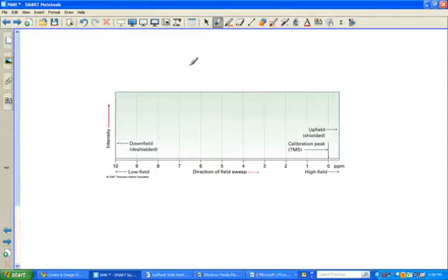This is basically a generic spectrum that you get in proton NMR. There are no peaks or signals shown on here, but I just have the axes shown and a couple of key words so you can see exactly what's going on. Notice the x-axis goes from 0 to 10, sometimes it'll go to 12. Units here are ppm, parts per million. You'll also see this axis labeled as chemical shift, or with the lowercase delta. You'll see the intensity being the y-axis. The higher peaks tend to be more intense.